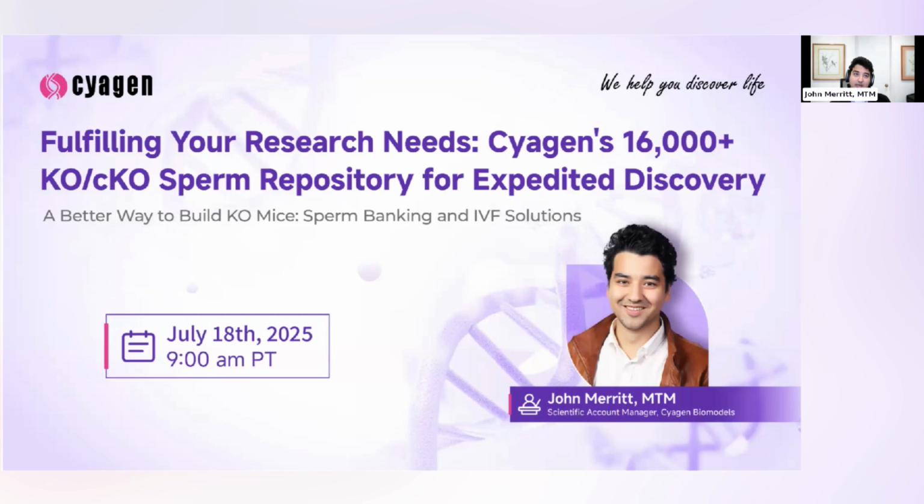These are essentially embryonic stem cells that have Cre, and so we can introduce the flox edit into those ES cells, and then perform a blastocyst injection, and get you flox Cre mice right off the bat.